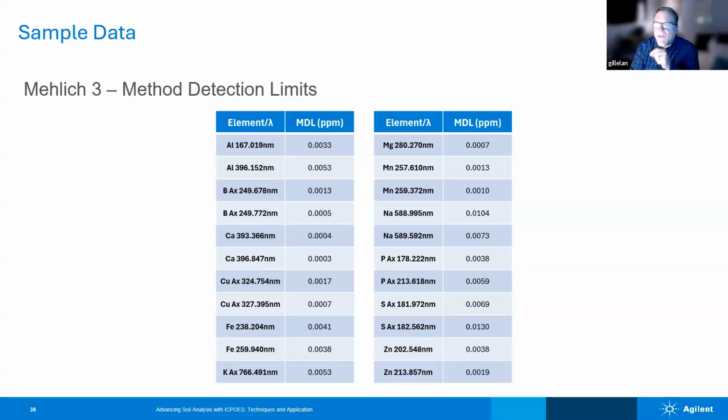I think so. Reading an incremental increase at a very low level, like a spike but a much lower spike, I think you're onto something there. I think we could do that and probably get a really good read on what you can see in the extraction itself.